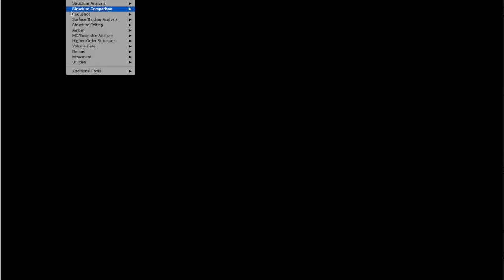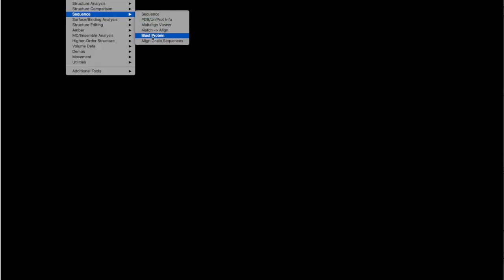Once we are ready with our sequence, we are going to go to Tools, Sequence and Blast Protein.